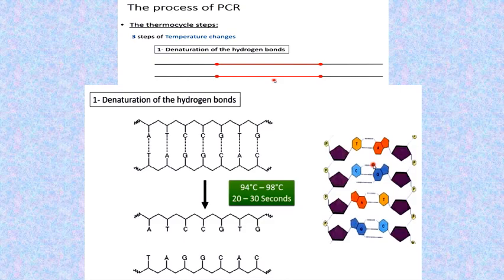Please take care that it is a thermocycle steps. Don't forget, it is a thermocycle steps, which repeated several times in each thermal cycle.